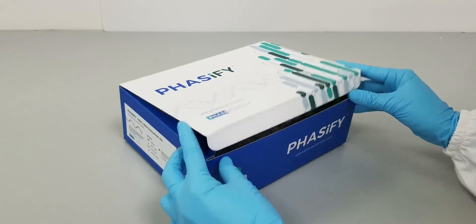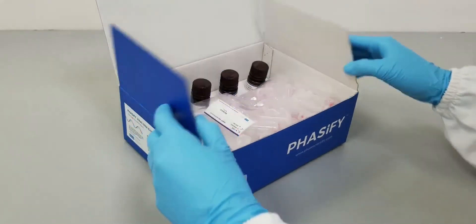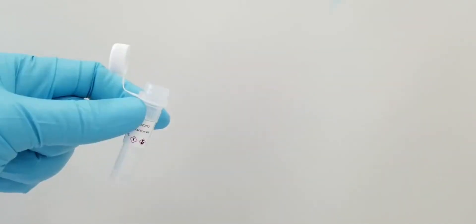When using the Phasify Viral RNA Extraction Kit for the first time, begin your solution preparation by adding 875 microliters of DNase RNase free water to a vial of powder B1.